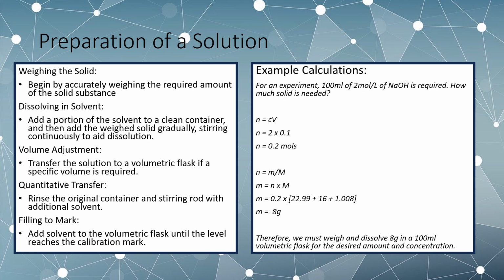for this experiment. You can see that the calculations aren't difficult, and the process is very straightforward. You're pretty much just dissolving the solid in a liquid and then putting it in your volumetric flask and making up to the mark. But you need to make sure you're precise in any of these steps, as any issues or any errors can cause issues in your later calculations.